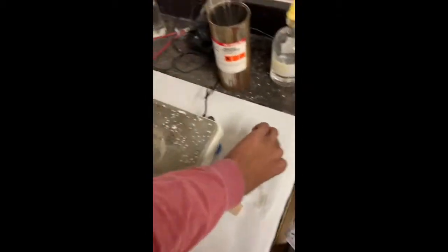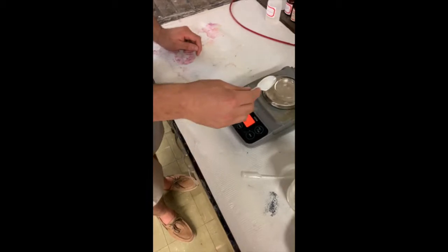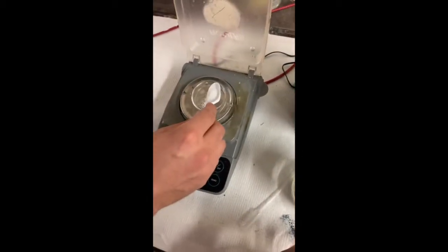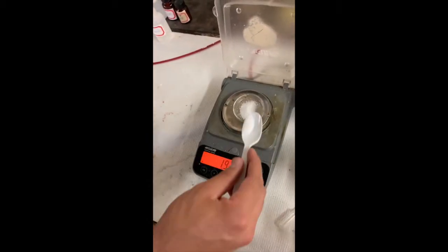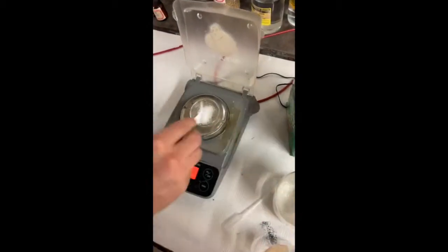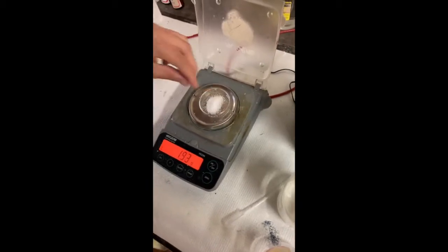So now we're going to move this over to the hood and mix our 2 grams of salt, or NaCl. Let's see if we can get this good, but we've got to measure it out first. Boom — very close. Scientific right here.